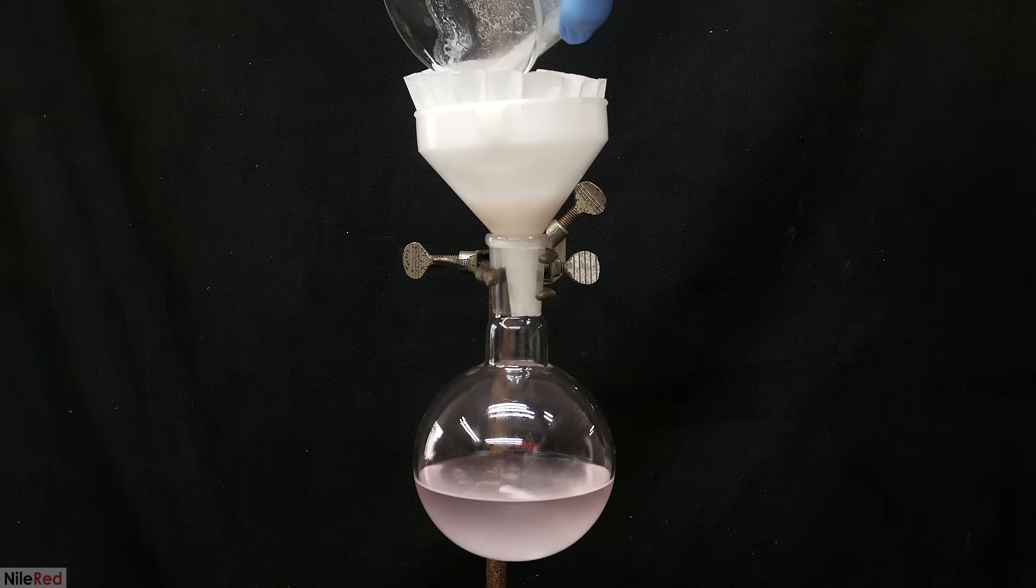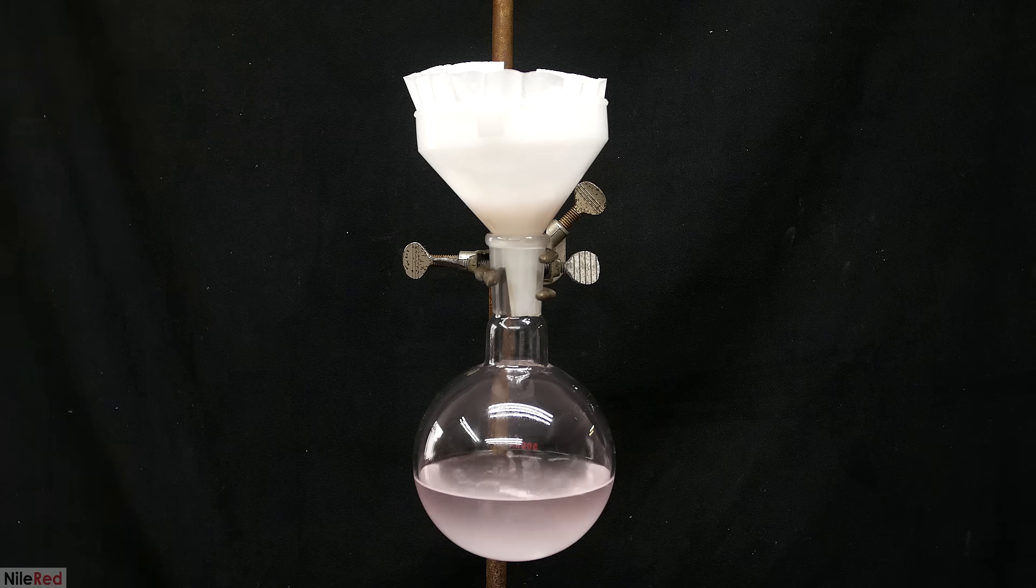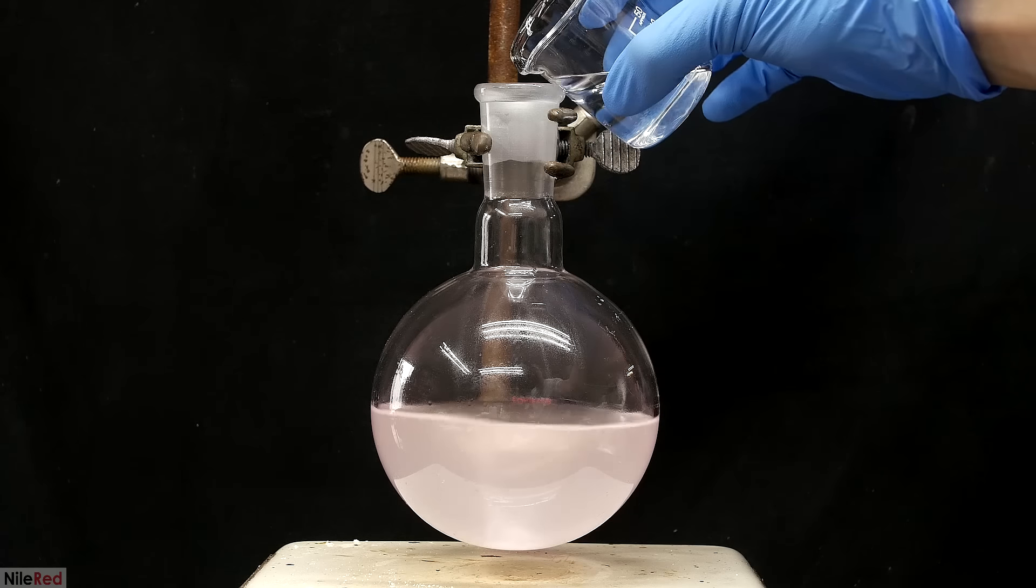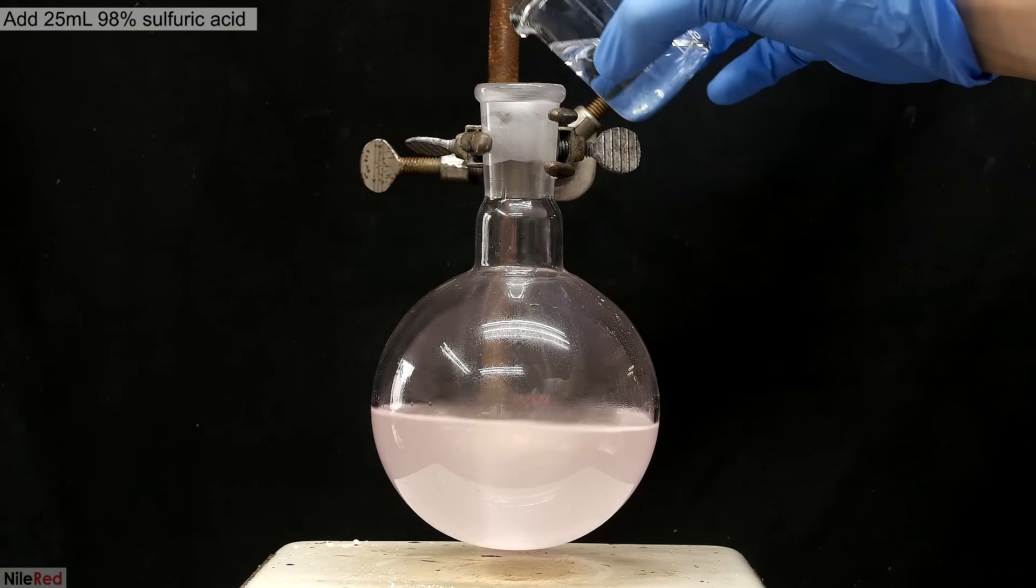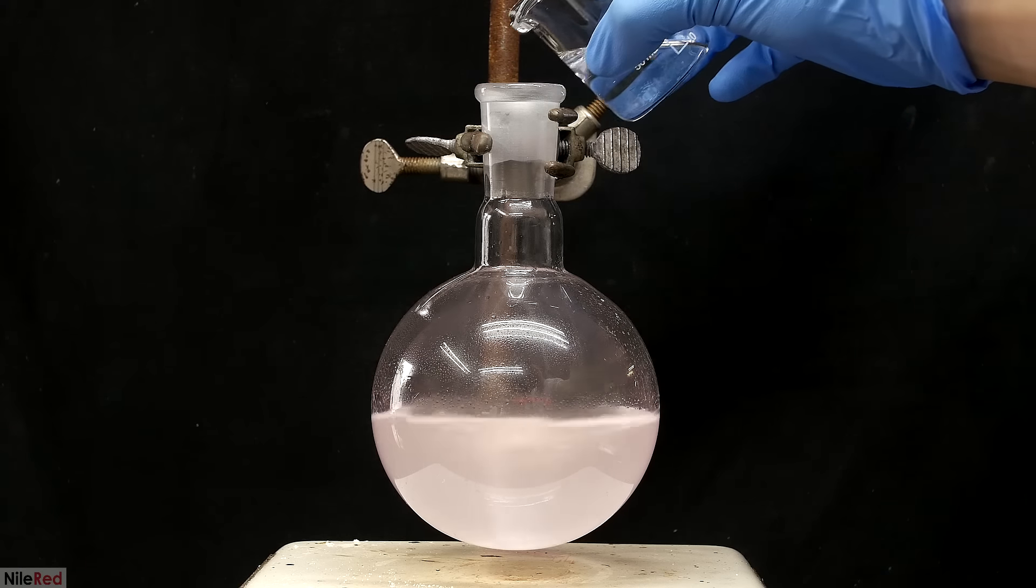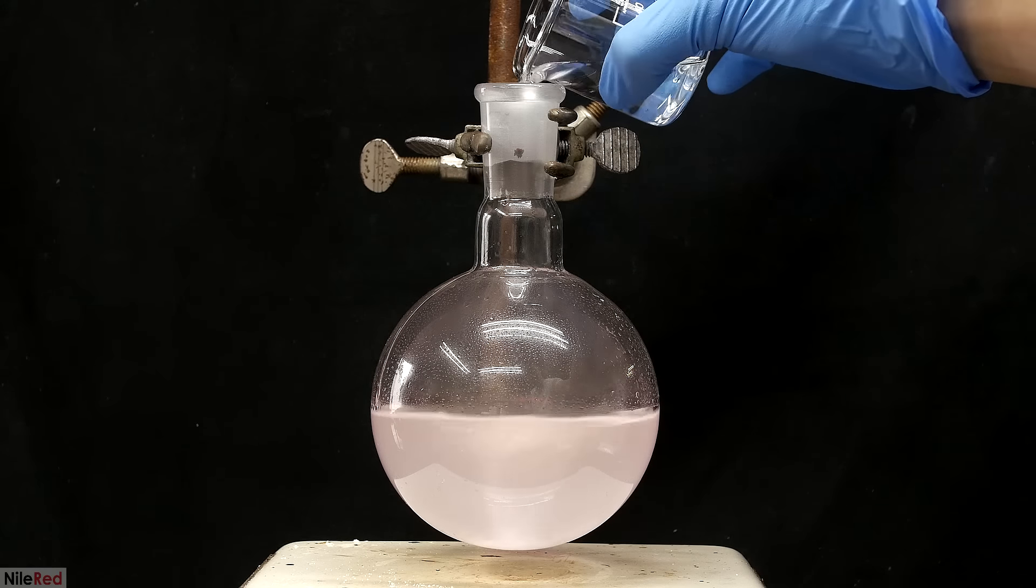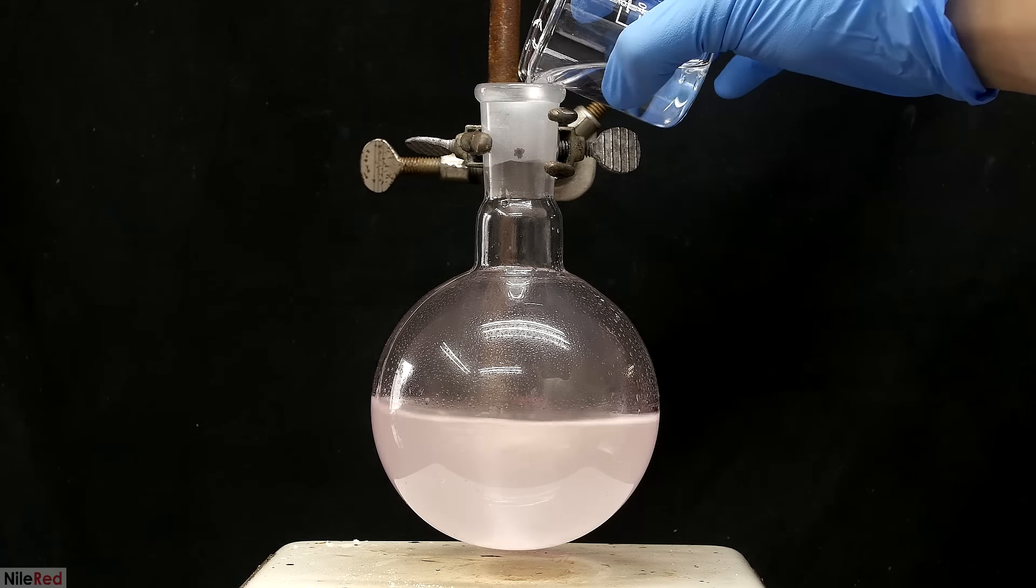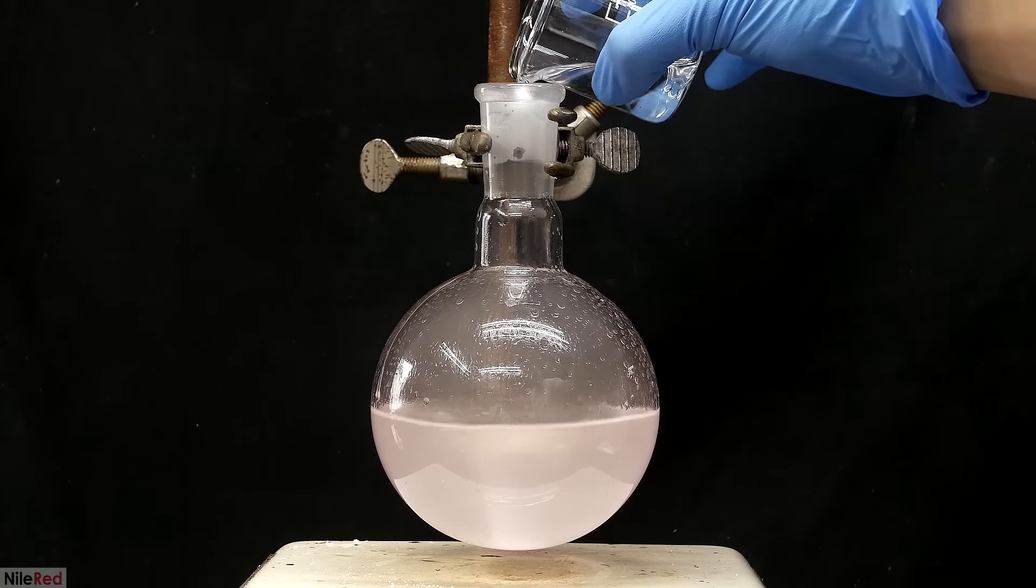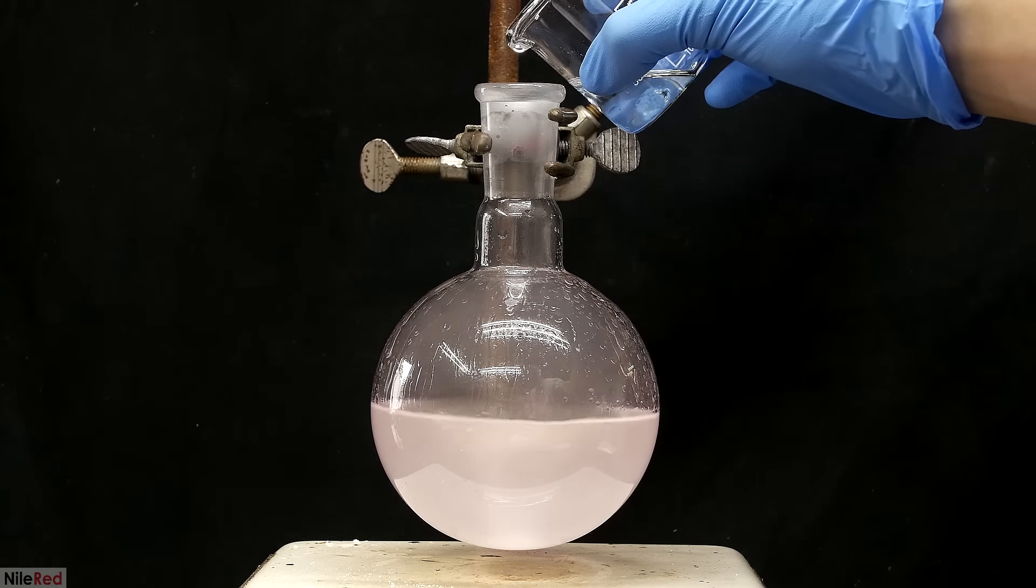After everything passes through, the beaker and the filter are both washed with a little bit of methanol. Then the filter is taken away, and I turn on some really strong stirring. I start to add the concentrated sulfuric acid, and it's very important to do this slowly, and carefully. Adding it generates a lot of heat, and it actually causes some of the methanol to boil. I'm stirring things here magnetically, but it's definitely possible to do it manually, you just have to add it a lot slower, and be a lot more careful.